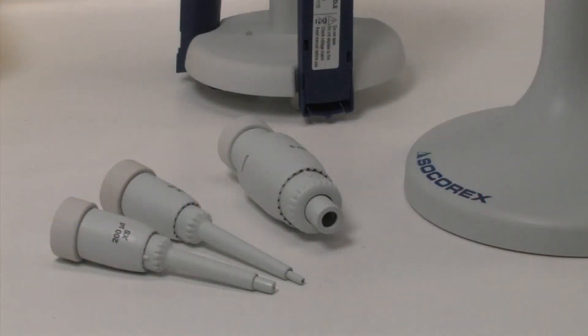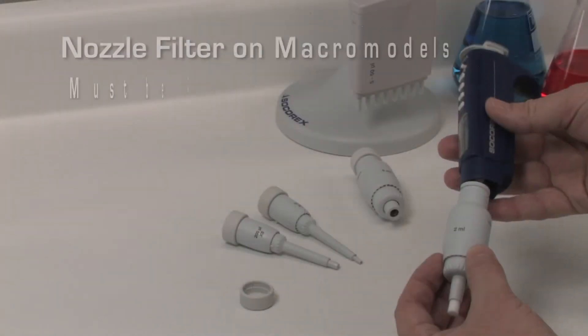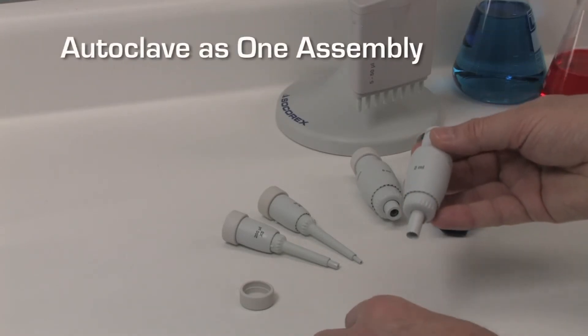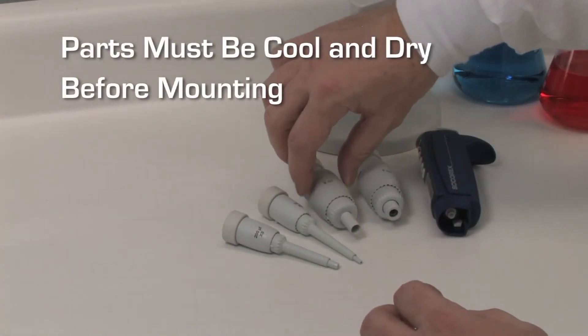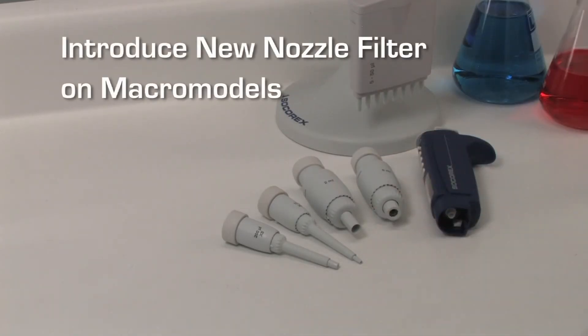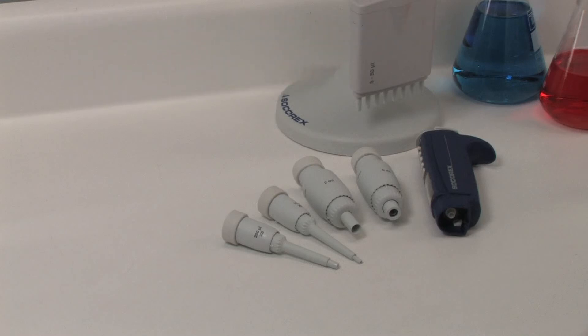Only the volumetric module is autoclavable at 120°C (250°F), and it must be disassembled from the control unit. The nozzle filter on macro models must be removed. Autoclave the volumetric module as one assembly. Parts must be cooled down and completely dry before mounting on a control unit. Introduce a new nozzle filter on macro models. Check for tightness and accuracy after the first cycle, then regularly, but at least after every 50 autoclaving cycles.